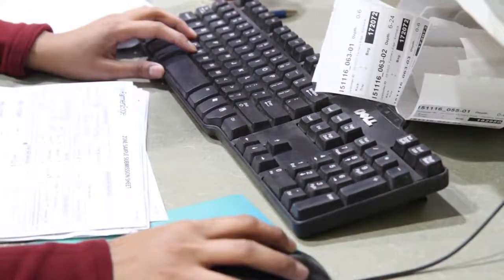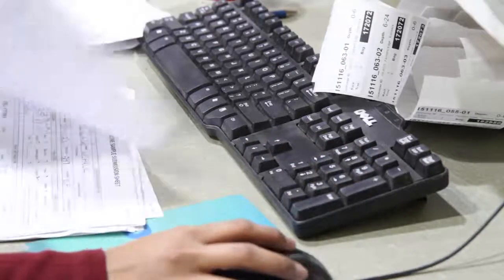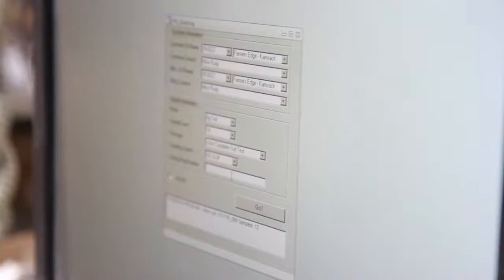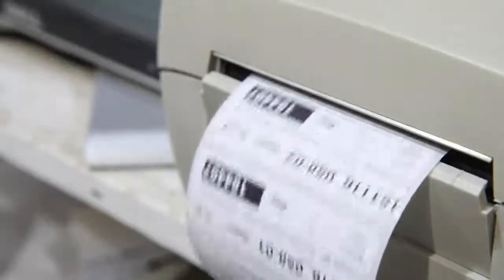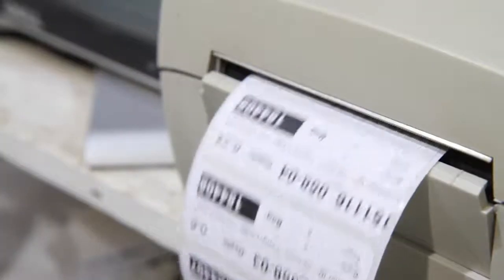While samples are being unpacked, work begins to enter the soil sample details into our Laboratory Information Management System, or LIMS. Account information, along with grower details, field information, and test packages required, is entered into the LIMS during the sample login process. LIMS handles sample routing through the lab and assigns sample IDs and tests to the incoming samples. LIMS also interfaces with the laboratory instruments, which we'll see later during sample analysis.